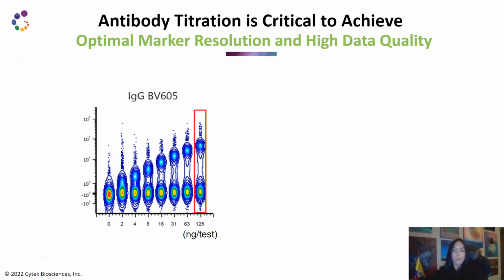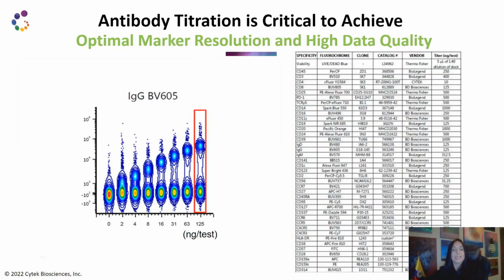Important thing, if you want to use this as a resource, is that in the publication, now you will have a table that is listing every single fluorochrome, every single reagent with the specificity, the fluor, information about the vendor, and also what titer was used, once again, in nanograms per test, important to report as concentration.